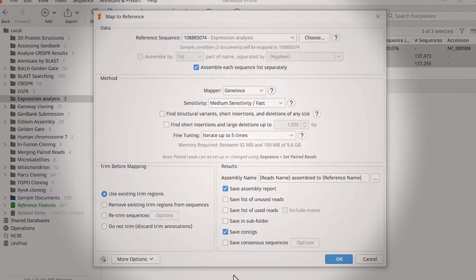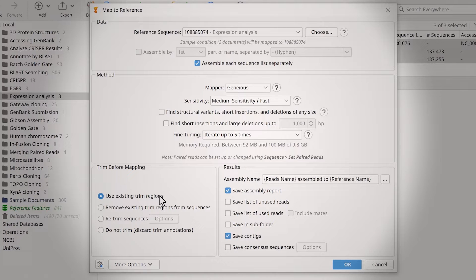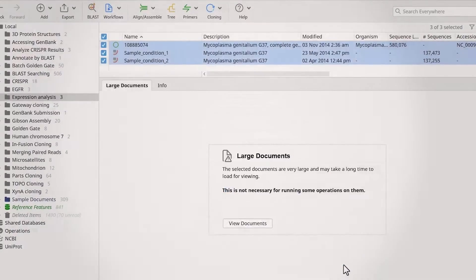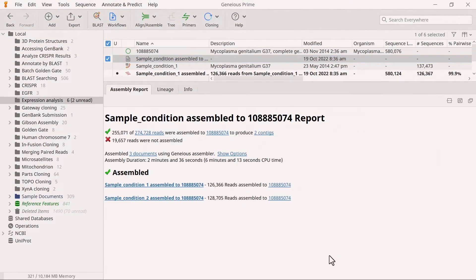In the bottom left, specify what level of trimming to apply before mapping. For this example, I will use existing trim regions. Lastly, in the bottom right, you can adjust what results should be returned from the mapping. When you're happy with these settings, click OK to run the assemblies.